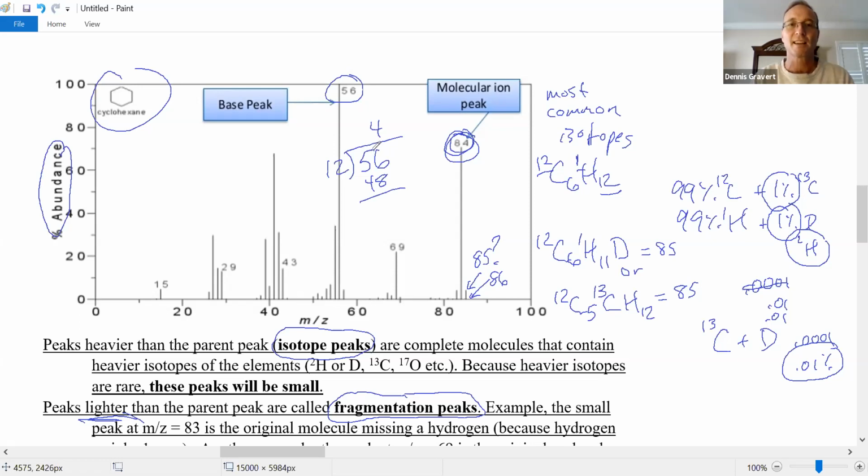And then subtract 8 from that. So 4, carry a 1. What was it called in the new math? It's like regroup. Regroup that. 16 minus 8 is 8. So the formula for mass 56 could be 4 carbons and 8 hydrogens. So what's left over is the number of hydrogens. And then I should probably check my math. C4H8, let's see, that's 4 times 12, which is 48, plus 8 hydrogens, that weighs 8, 48 and 8, yeah, that's 56. Good. Check my math, that looks good.